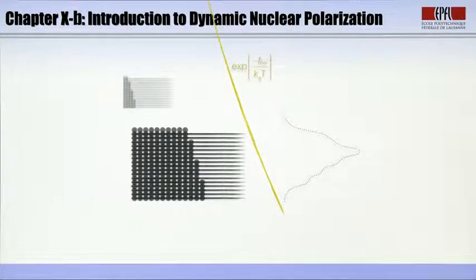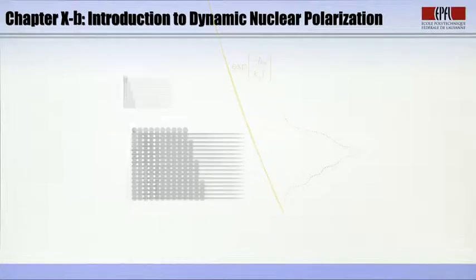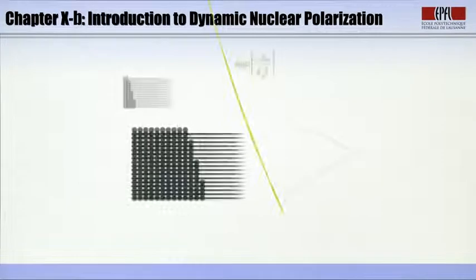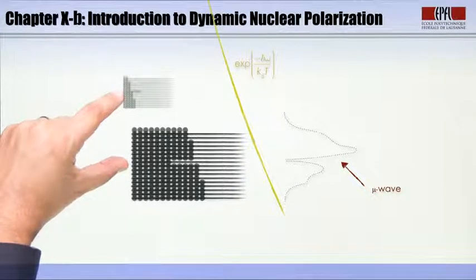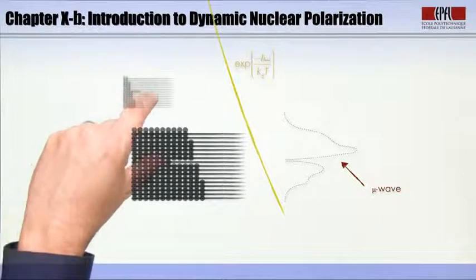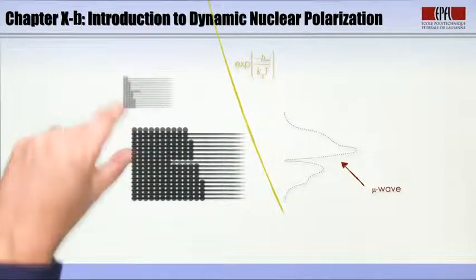Now, what happens if you shine microwave on one of these transitions? Well, we're going to see that what might happen is that you're going to dig a hole in the ESR line. So you're going to saturate the electron spin at well-defined frequencies. Now, looking back at our energy levels and population distribution, by shining microwave at a specific transition frequency, for example here, you're going to tend to equilibrate the distribution of population among those two energy levels here. And that's what digging a hole means.